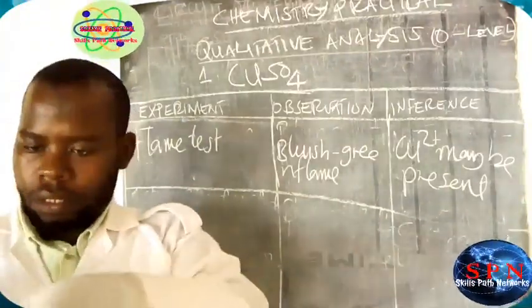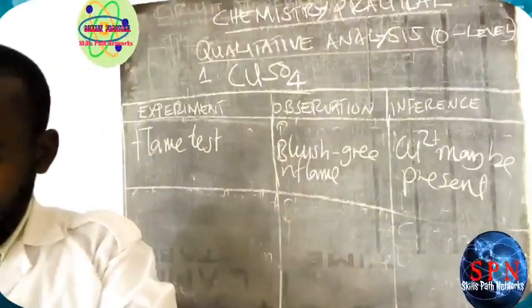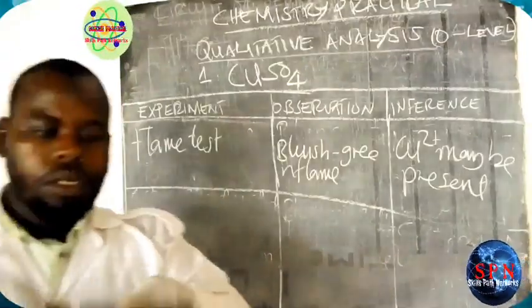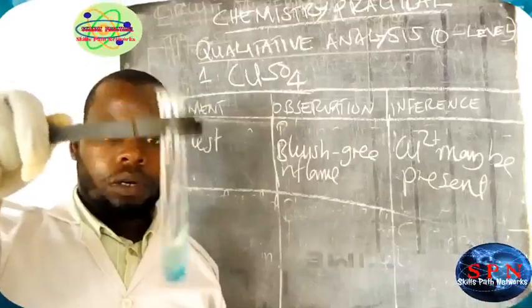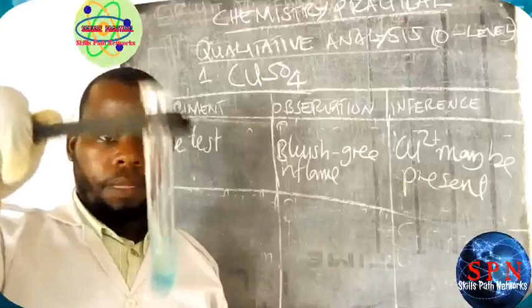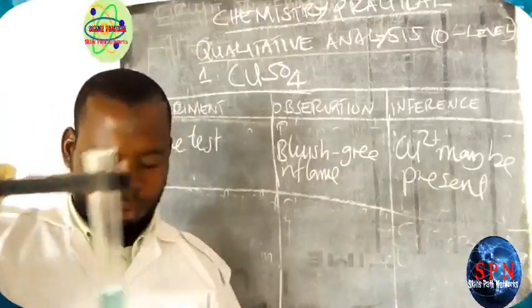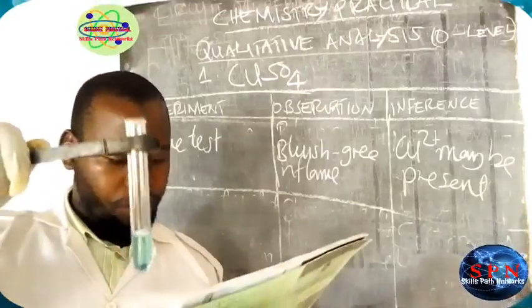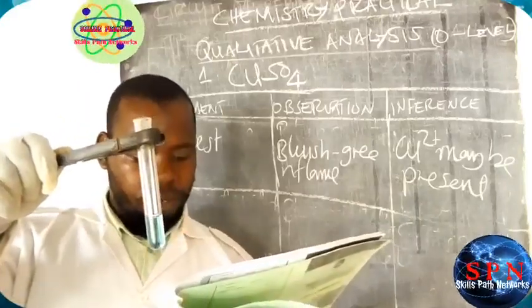Then you are going to see whether it is soluble or insoluble. According to our sheet here, the observation should be soluble forming a blue solution.